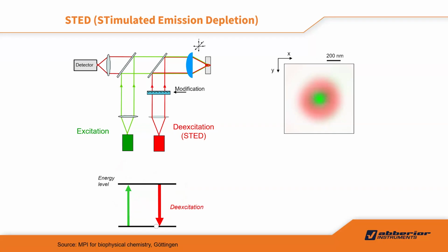And then the energy will be used to generate a second STED photon. Without the STED beam, the energy will be used to generate the signal spectrum photon. With the STED beam, the energy will be used to generate a second STED photon. So actually, the process here is the same as how the laser is generated: light amplification by stimulated emission of radiation. STED is stimulated emission depletion, right?